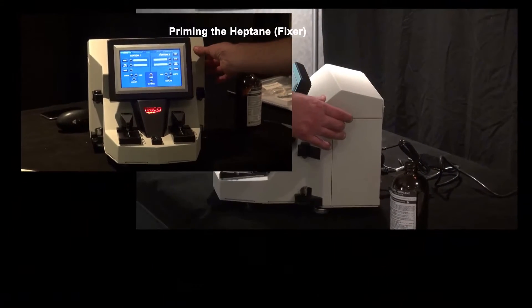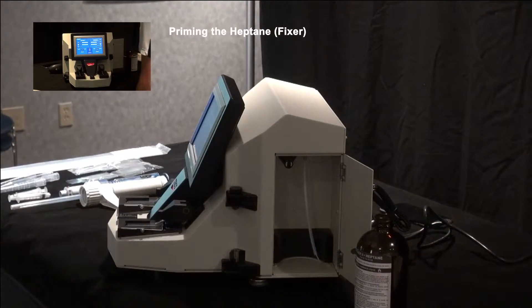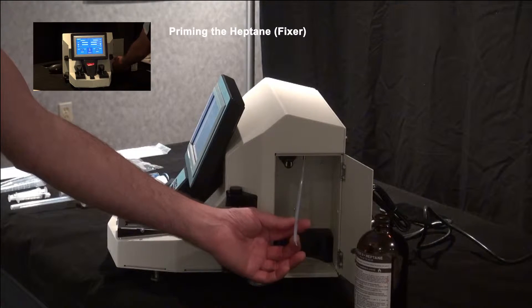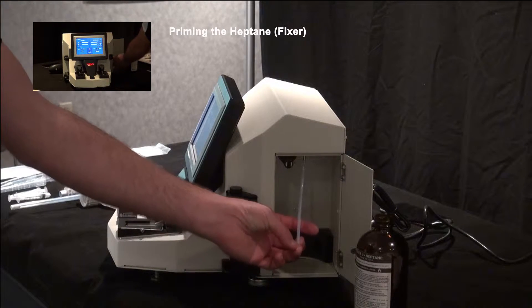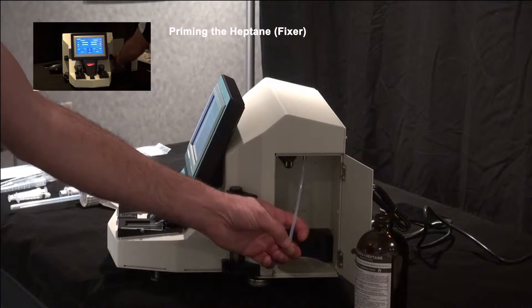We're going to open the fixture bay door on the right side of the instrument. Inside, pull out the Teflon tube with two smaller tubes. We are going to attach the priming bulb, which comes in the parts kit, to this and pump the heptane in to prime it.